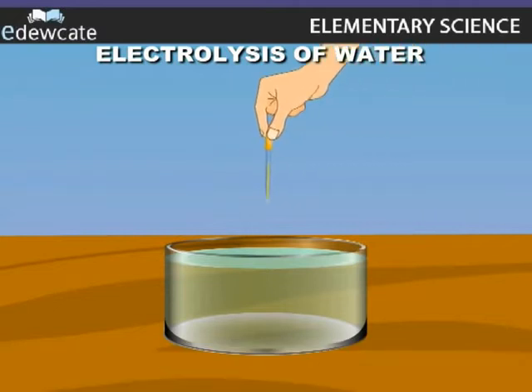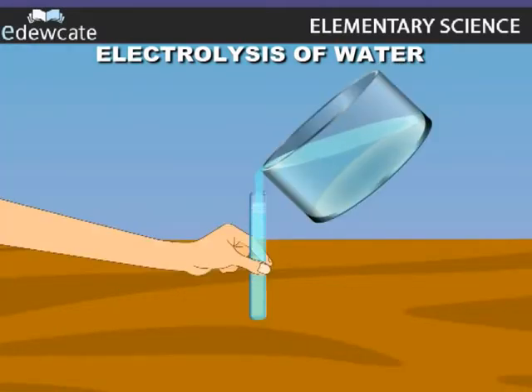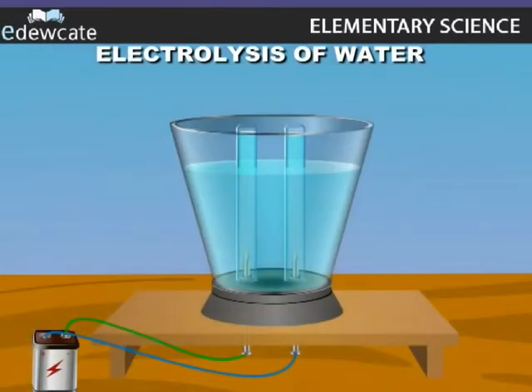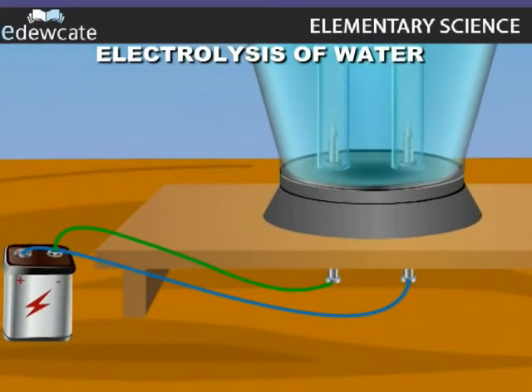Dissolve a little quantity of acid in water. Pour the solution into an apparatus as shown here. Fill two test tubes with the solution and ensure no air bubbles are present. Invert these test tubes over the iron nails, which are called electrodes.